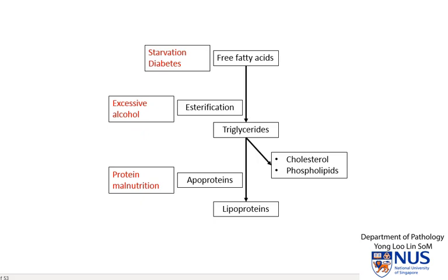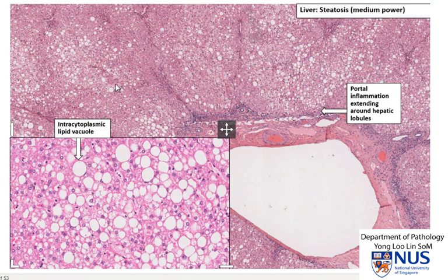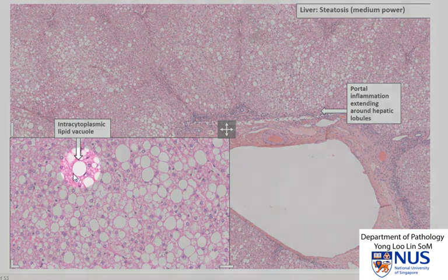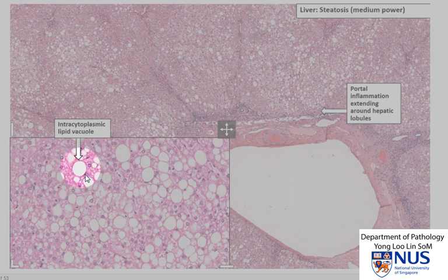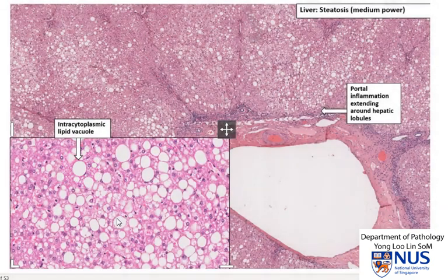What do we actually see under the microscope? Here is a low power picture, and you can see a lot of rounded whitish spaces. These are actually empty spaces which originally contained the lipids — they are washed out by solvents during the processing of microscopic slides. If you look at this particular cell here, this entire round globule is a lipid vacuole, and it has actually squashed the nucleus of the hepatocyte to a little slit. In some cells you can see the nucleus a little bit better — you can still see the lipid but also the nucleus of the hepatocyte. These are not adipocytes; they are actually hepatocytes.